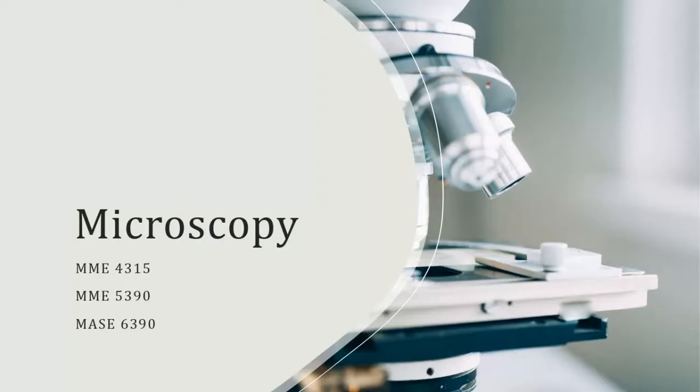Okay, happy 6th week of our metallurgy class. I'll be talking about microscopy and go through a couple examples of microstructures on quality of imaging and also to understand how a microscope works.